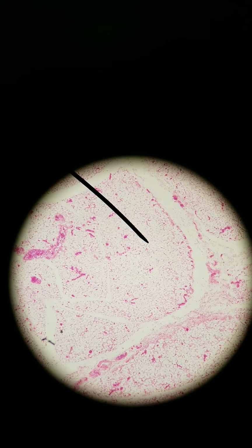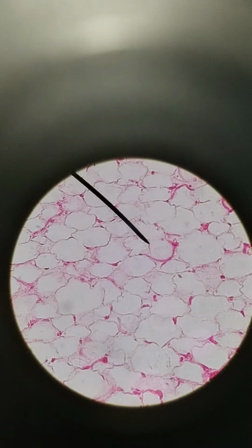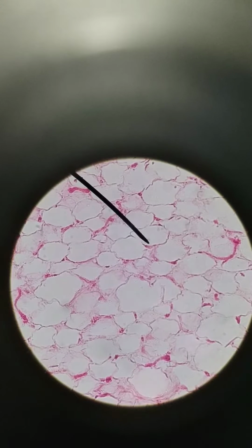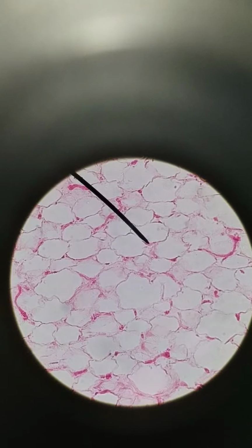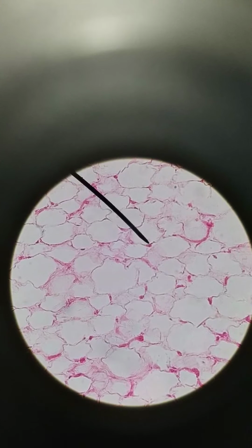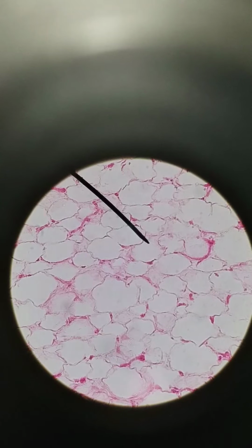So we're looking right now at a tissue that has very large round cells. This is 40x total, 100x total, 400x total. These are adipocytes. We are looking at adipose tissue. You can see wherever it gets darker, like where I'm pointing my arrow and down here, these are the nuclei, as well as all the organelles. What's stored in these large white areas, that's where adipose is stored. So adipose fills up the cell and pushes the rest of the contents of the cell off to the side.